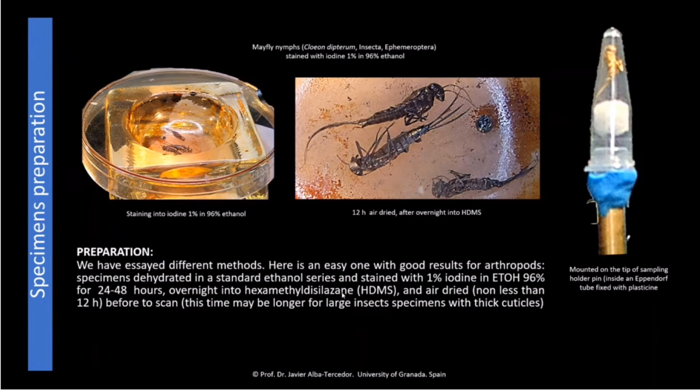How long do your scans typically take, Javier? Everyone that works with micro-CT knows that you need to find the equilibrium between quality and time-consuming. But normally, because I don't have any problem with the instrument, I can use it as much as I like. Some of them have taken more than 8 or 10 hours, but little animals you can get in 4 hours or even less. It depends on the detail that you want to get.